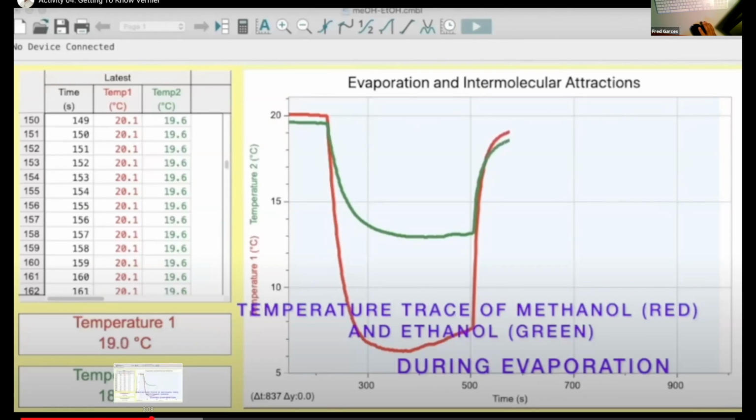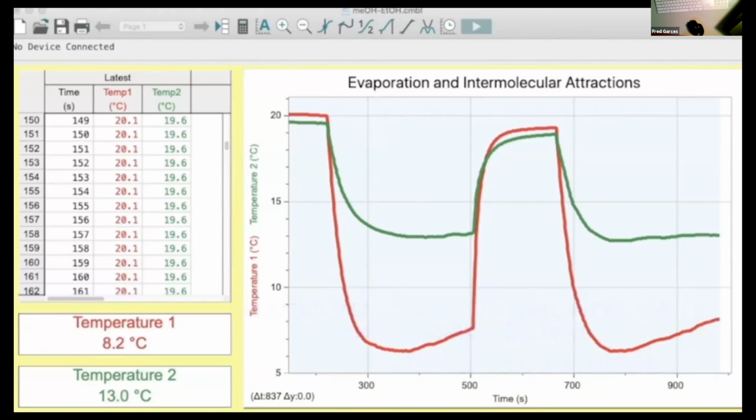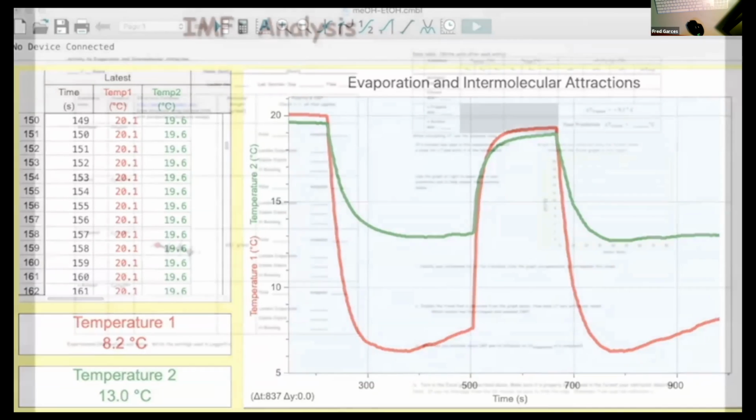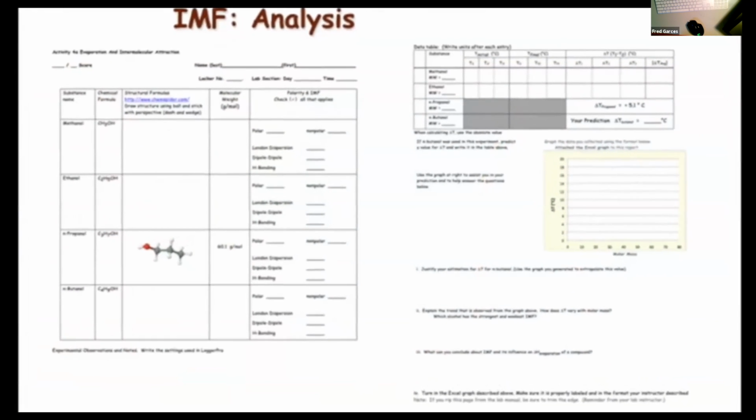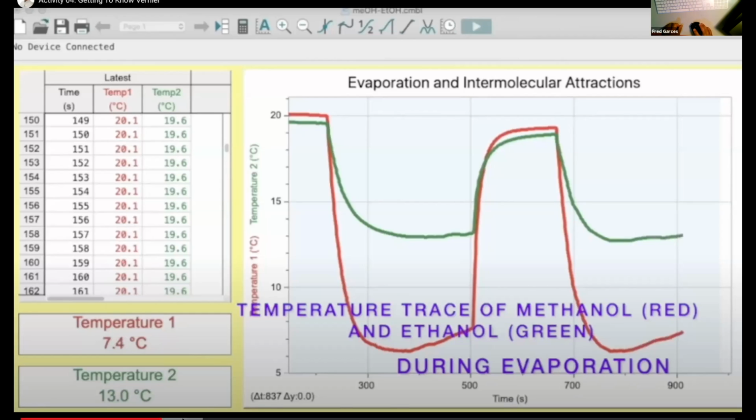Okay, now you notice this is not moving, and the reason why this is not moving is because this is at the 150, 162. The data points is all the way on top. See how that's moving right there? Okay, that's because it's being collected, but your frame is between 150 and 162 in terms of this. That's why it's not shown. Anyway, that's the data for this particular experiment. It's also in the data that you can download.